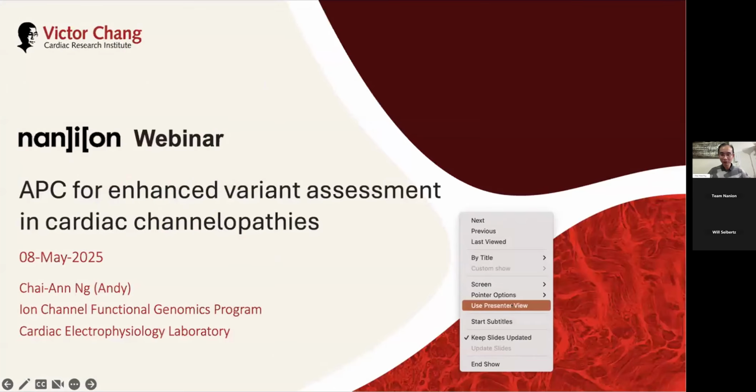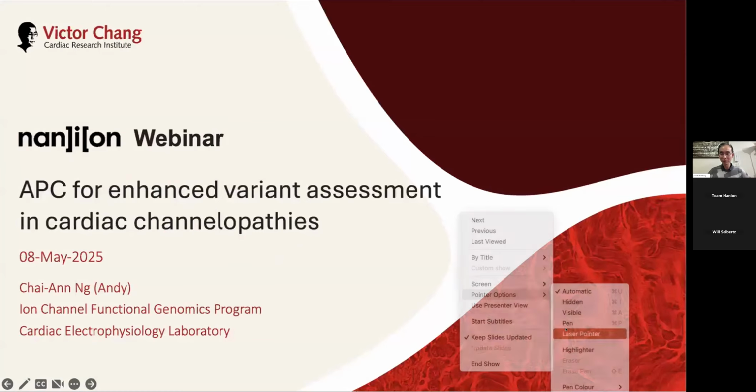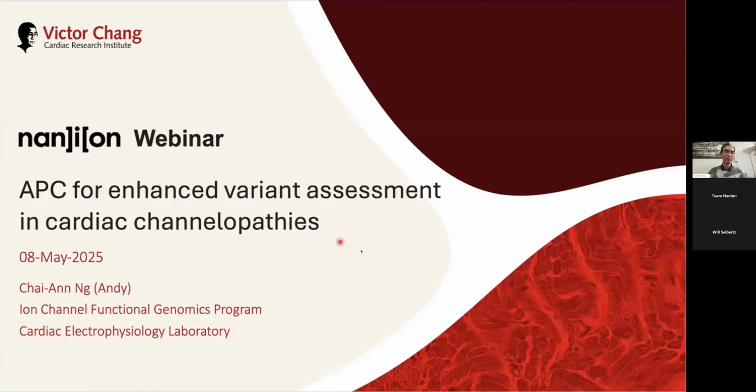I'll put my laser pointer on. So today I'm going to talk to you about how I use the patch clamp to enhance variant assessment, as well as some risk predictions and penetrance determinations in cardiac channelopathies.